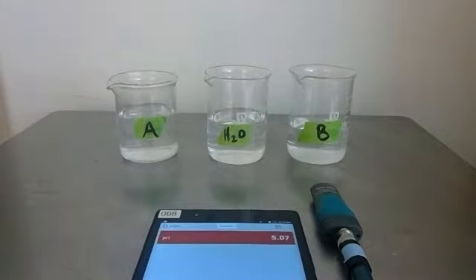In this video we're going to explore the pH of an acid and a base and what that solution looks like when an indicator is added. An indicator is usually a dye molecule that is a different color depending on if it's in an acidic environment or a basic environment.